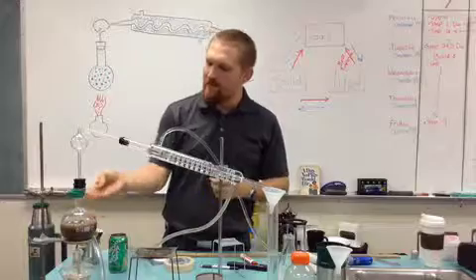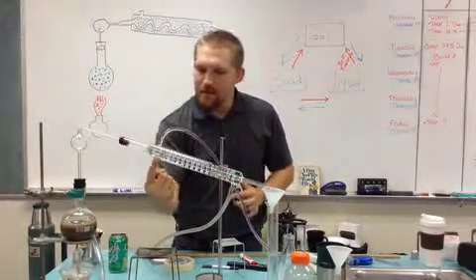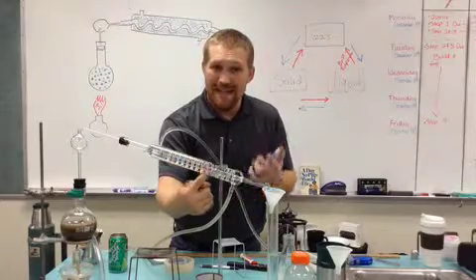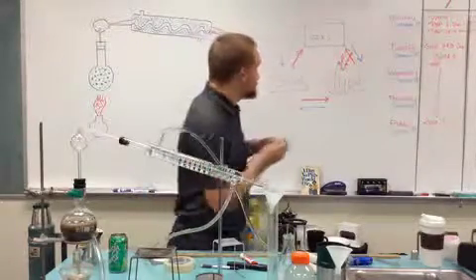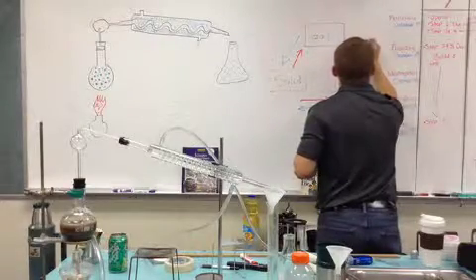I've taken my liquid, I've boiled it into a gas. The gas is moving through here, and then as it goes through here, I'm trying to condense it back into a liquid. So when we go from a gas to a liquid, that's called condensing.